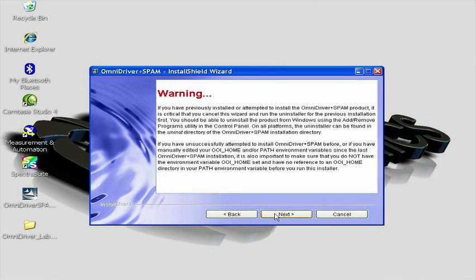Next, you will see a warning to uninstall any previous versions of Omni Driver. We will assume that you are installing Omni Driver for the first time in this tutorial. After you have read this warning, click Next.